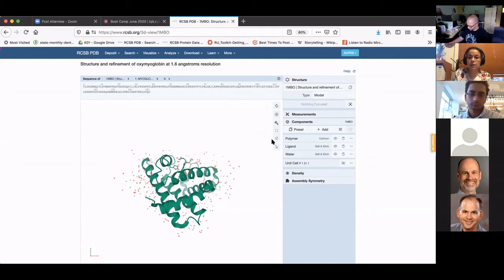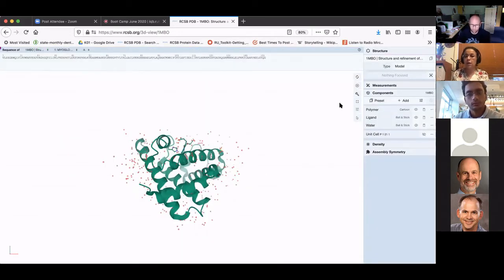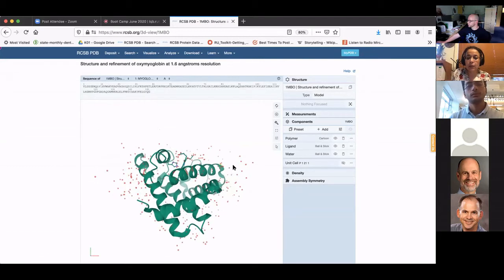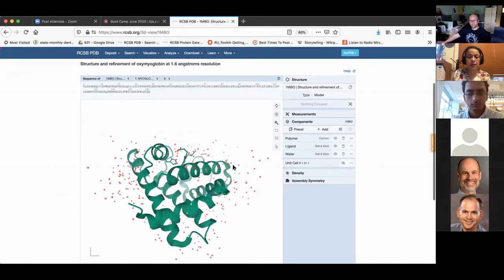Another thing I wanted to say is that if you want to increase the working space for this particular tool, you can just click on this and it opens it up. I'm going to keep it closed because the Zoom participants are showing up and that's kind of confusing me. But okay, quickly, the mouse control is very intuitive. There's really not much to tell you specifically, but if you have a different kind of device and you are finding it uncomfortable, there is help documentation here.